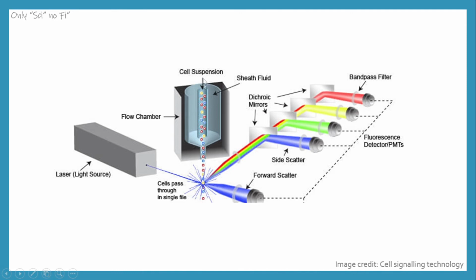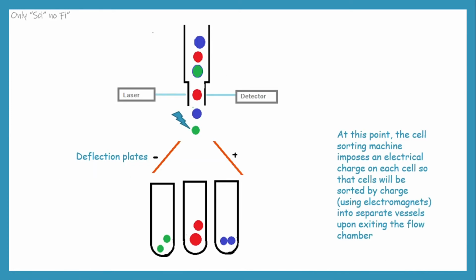As I mentioned, there is a cell suspension, drop by drop. Now, this is called a drop, which passes through a laser beam. There are forward scatter detectors, side scatter, as well as various other detectors which measure fluorescence, and this is connected to the photomultiplier tube. And how do you exactly now sort the cells? This is how: as I already mentioned, the laser, forward scatter, side scatter, and fluorescence are detected by the detector.